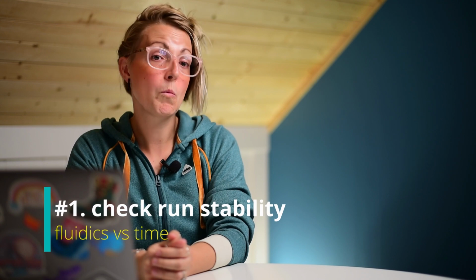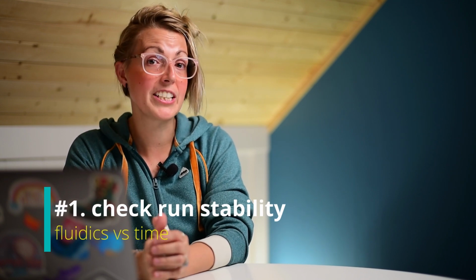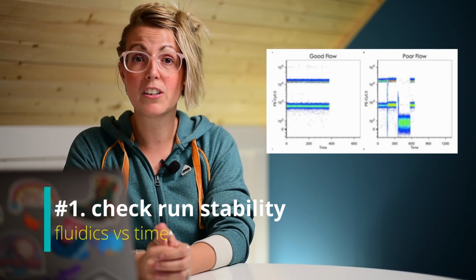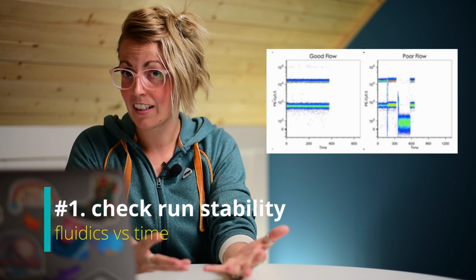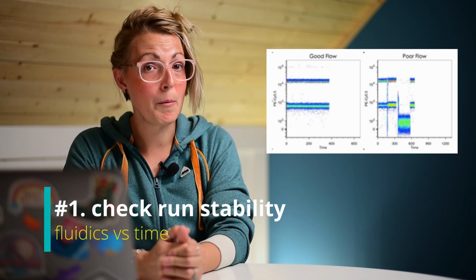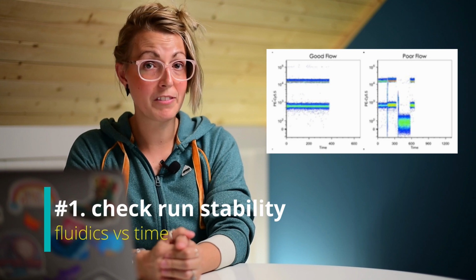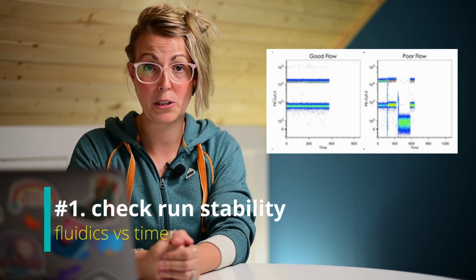Now that we've gone through the basics of what you should include in your publications, here's 10 tips to make your data look great. Number 1, always check your run stability. So this goes back to our initial fluidics lecture, where we looked at normal stable flow versus improper fluidics. Now you can either do this manually and gate around problem areas, or if using FlowJo, there are a number of plugins that will automatically remove these for you.